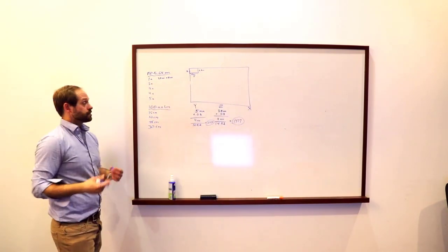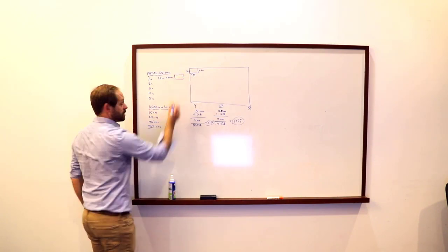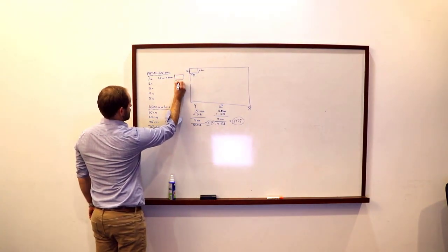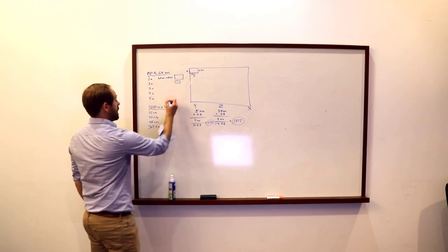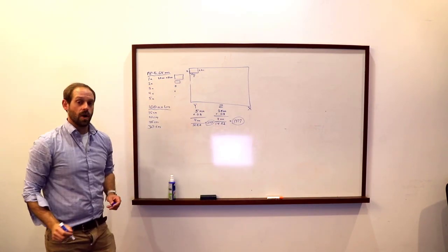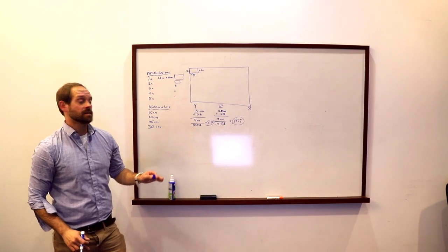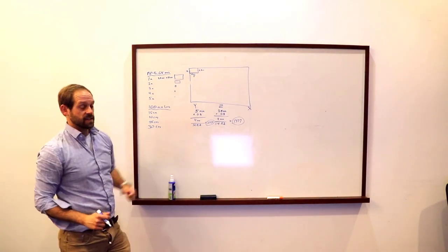But just know that the 1x obviously is going to have a larger field of view because it's at 1x magnification, whereas the 2x is going to have essentially half that field of view because we're at 2x magnification, and so on down the line. So the amount of area that you see in each magnification is going to get progressively smaller. So these axes are going to change. But again, these numbers are already calculated out for you in the table.